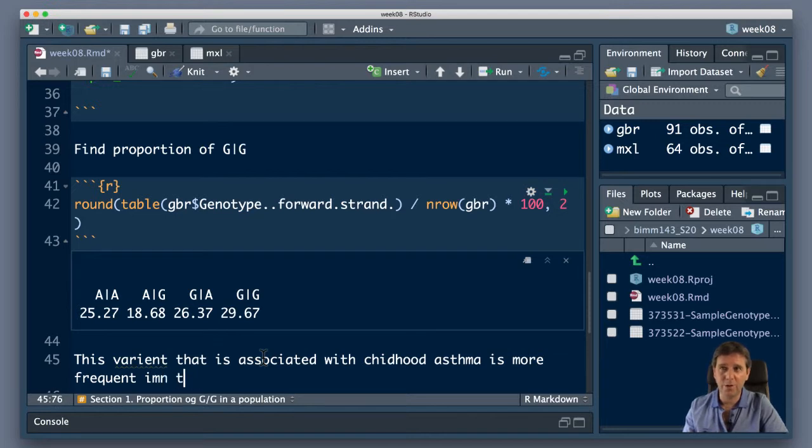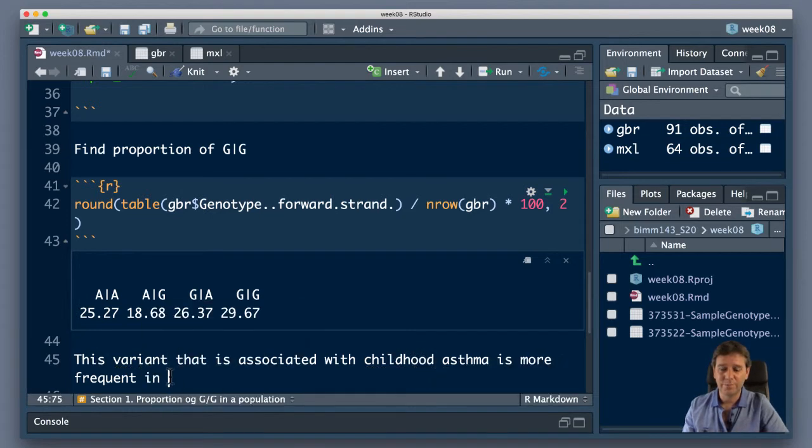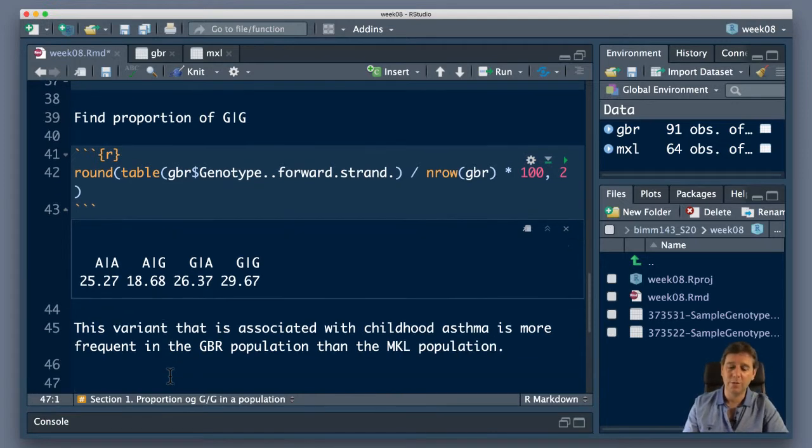I'm typing without looking because of the way my screen is set up. I have multiple things open, so you have to excuse me. I've probably misspelled all sorts of things. Childhood variant. Okay, so I'm just writing the note so I know what's going on.